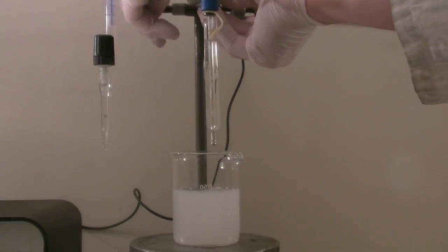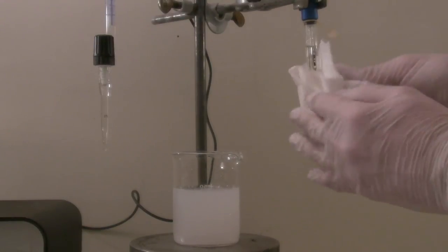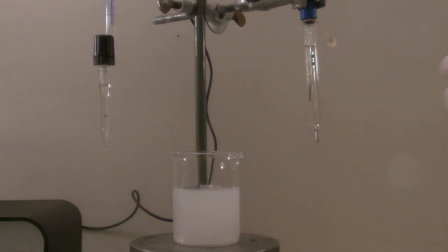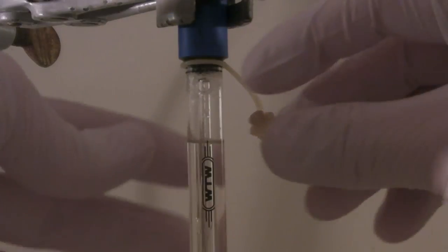At the end, the electrode was taken out of the solution, washed with distilled water and wiped with a paper towel. The cap with the reference electrolyte was put on again and the refill opening was closed.